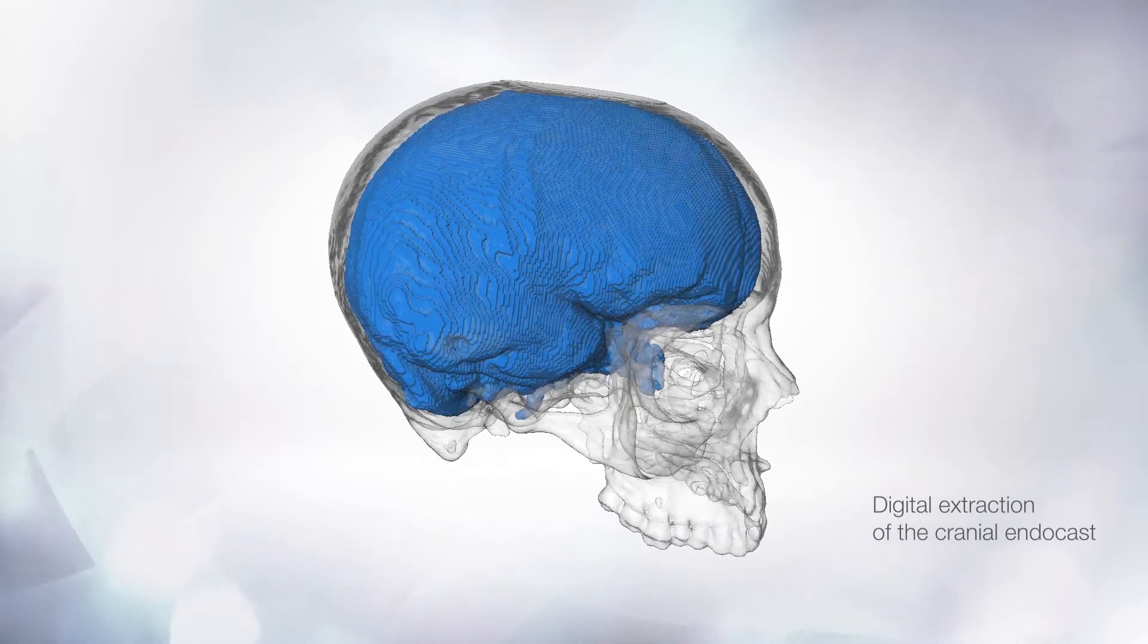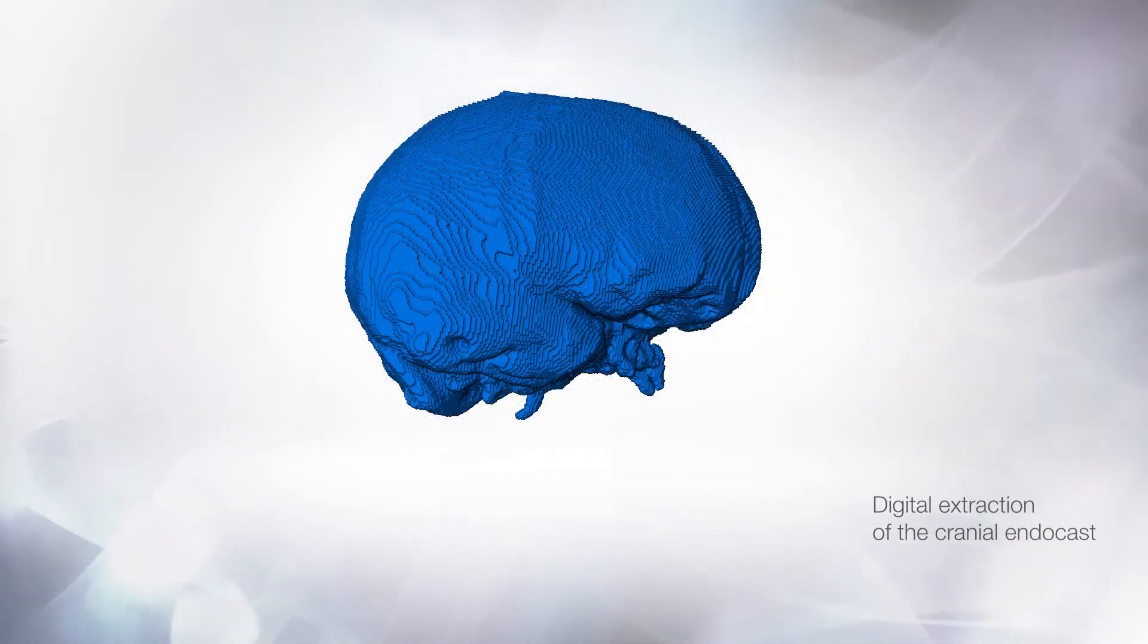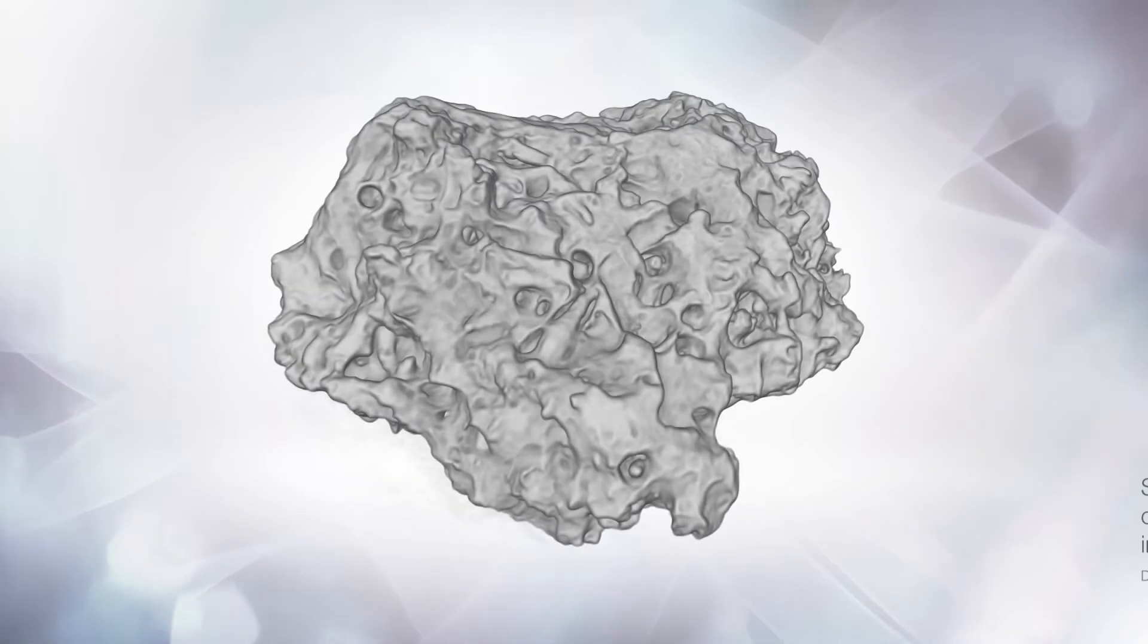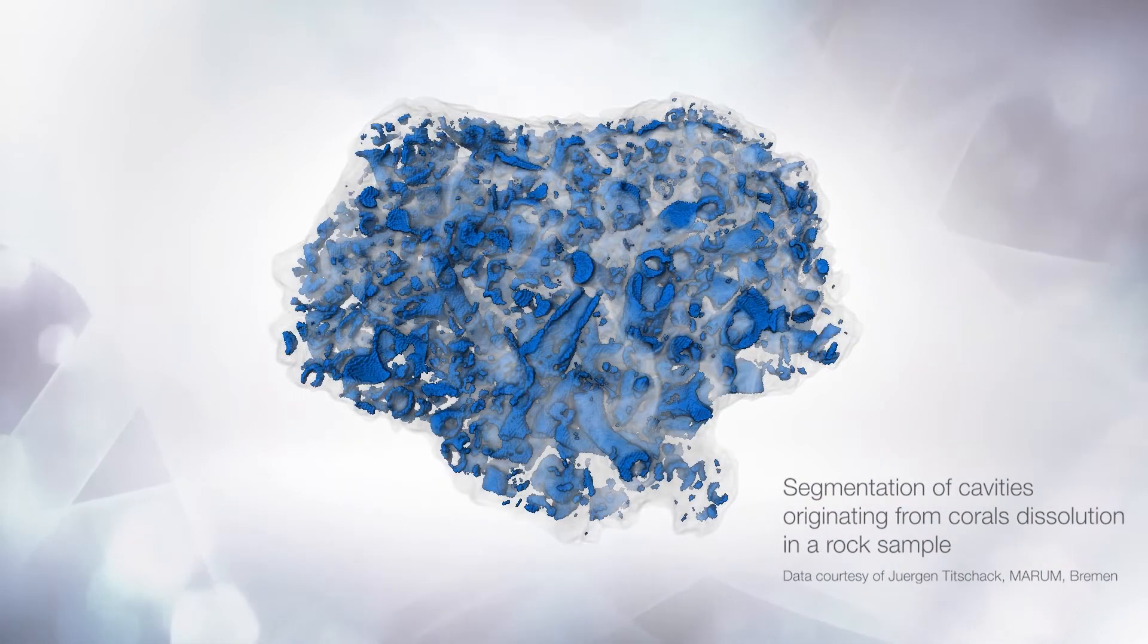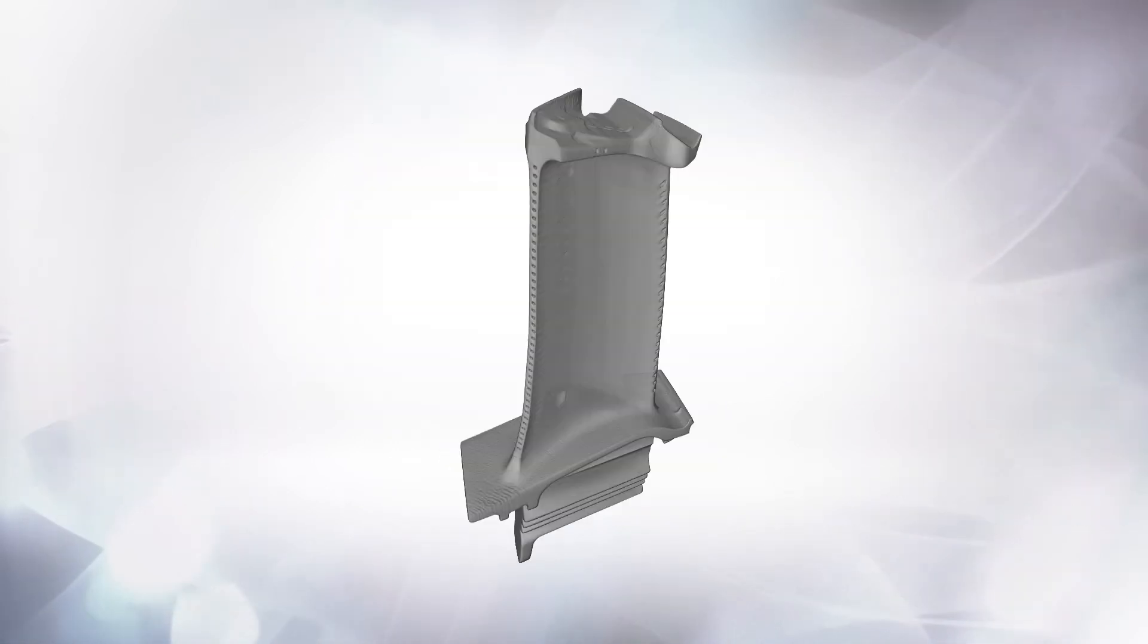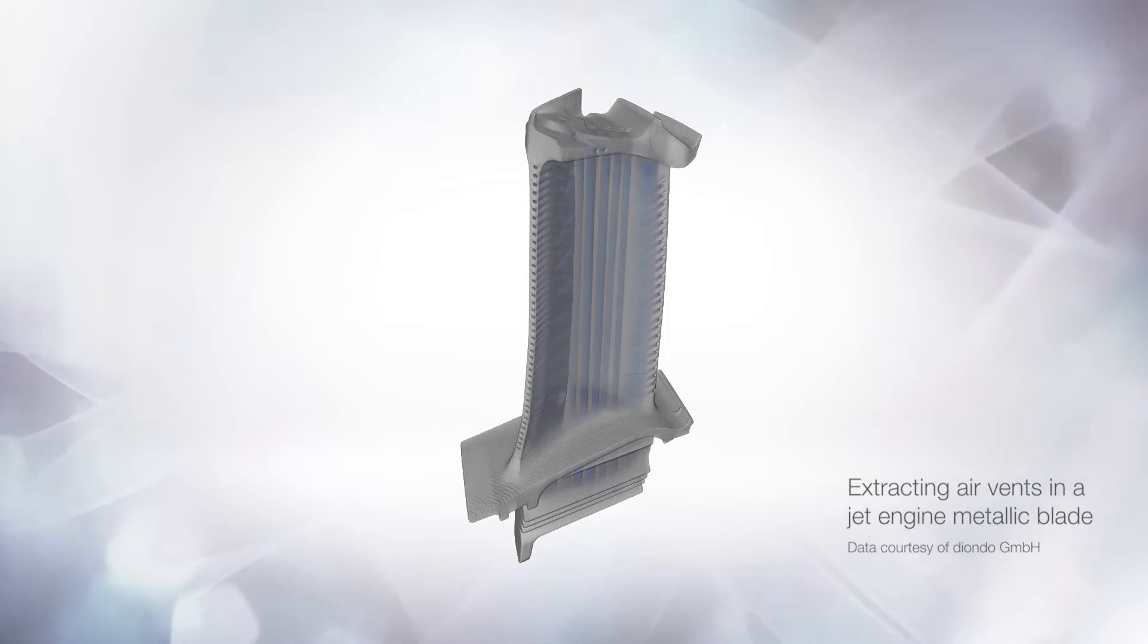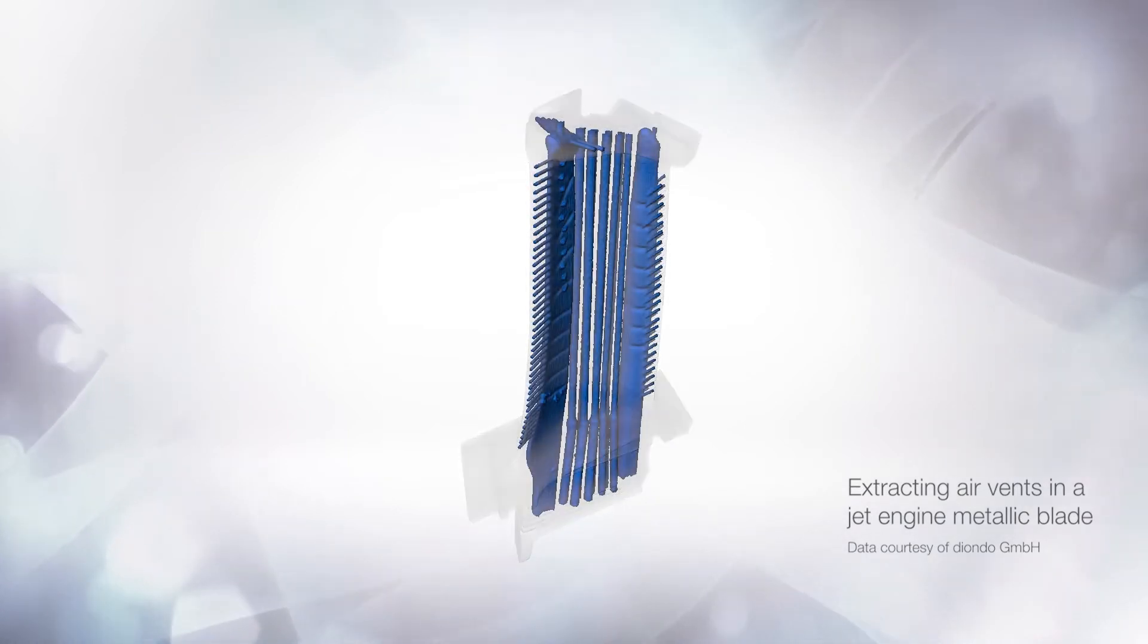This tutorial explains how to use the Compute Ambient Occlusion module to extract cavities in binary images. Usually, the cavities belong to the background and the object is given as foreground. The Compute Ambient Occlusion module is particularly useful if the cavities are connected to the background outside the object.